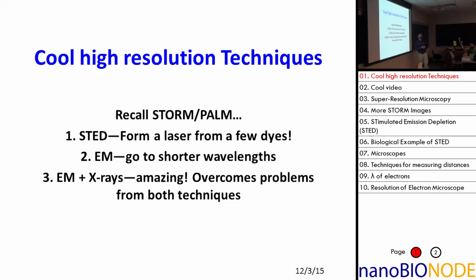And if you want to see with super resolution, that is, you can see much better than that, you need to use one of these new techniques that just won the Nobel Prize, which is either called STORM or PALM, and we'll go over that for just a second.